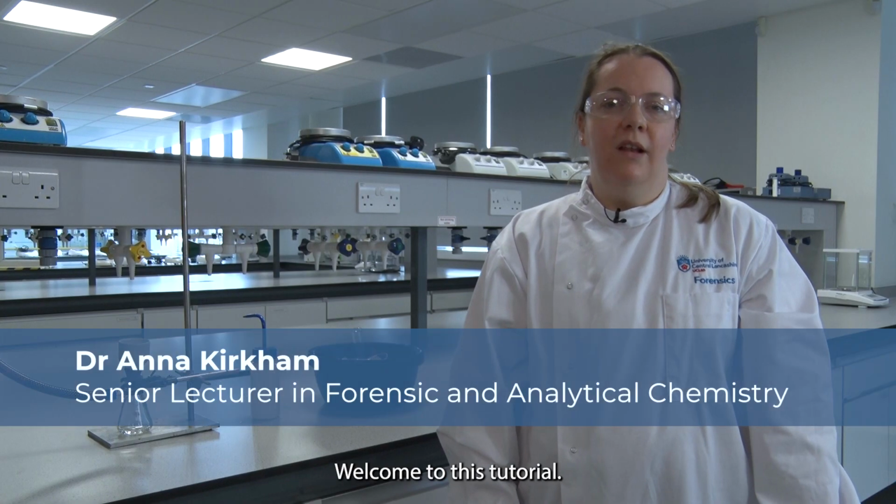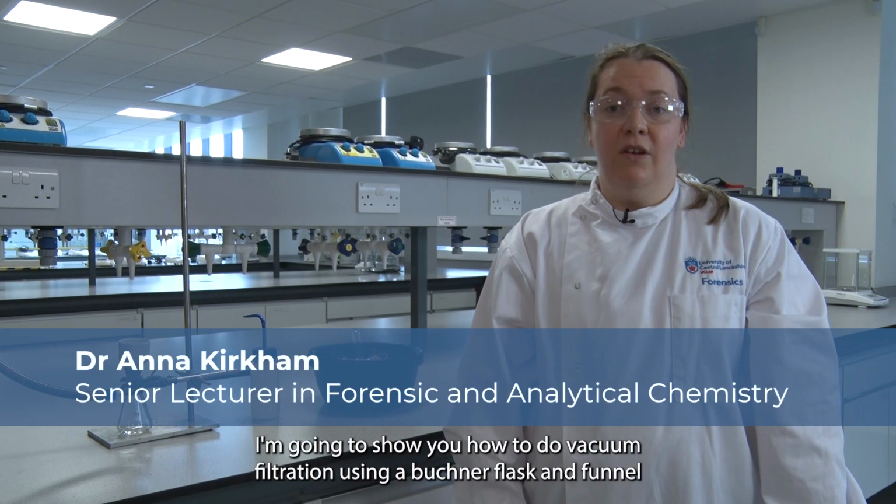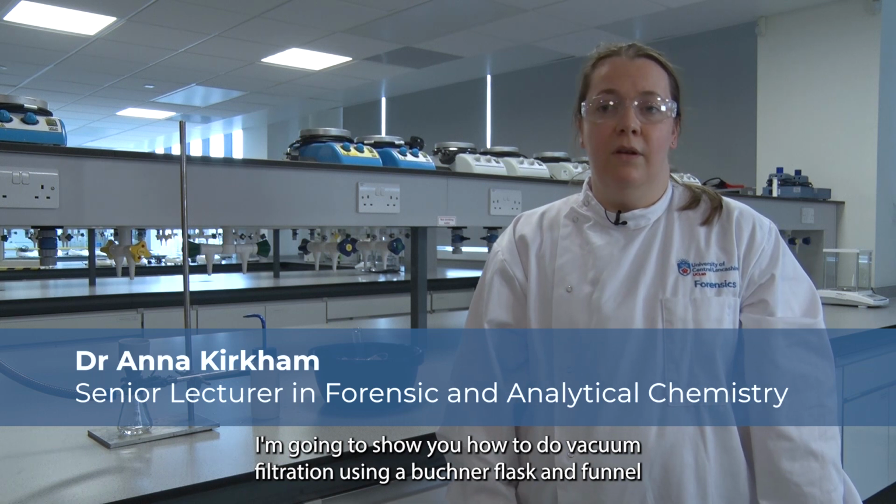Welcome to this tutorial. I'm going to show you how to do vacuum filtration using a Buchner flask and funnel.